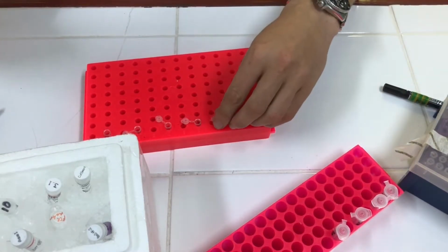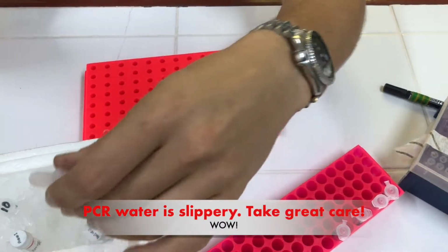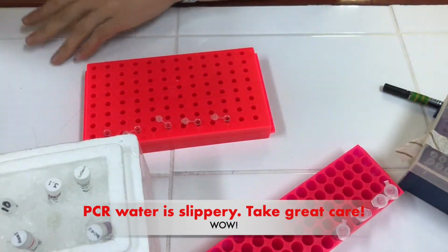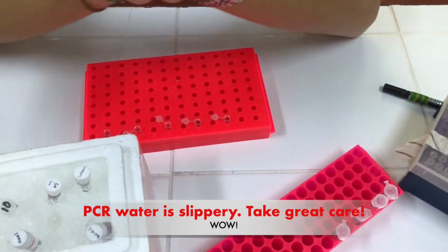Okay, so in each tube right now I have some PCR water here. I need to thaw a bit.